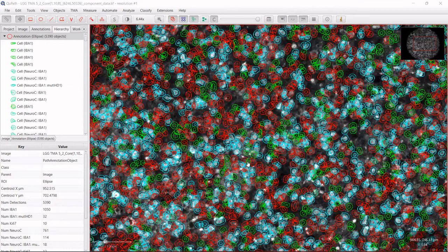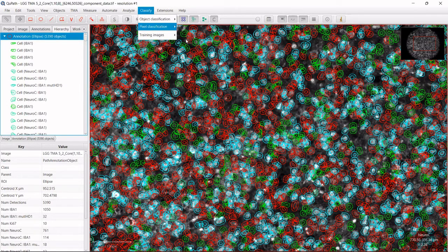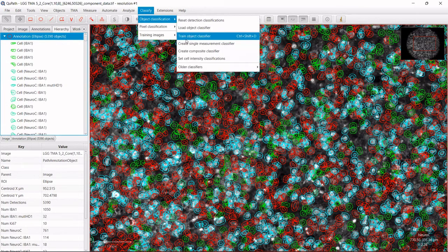I want to point out that you can also classify cells by training an Object Classifier. When doing that, you annotate a few cells as belonging to a class and a few that do not. QuPath then automatically extracts measurements — which can be more than a single measurement — to determine whether all cells belong to that class or not.